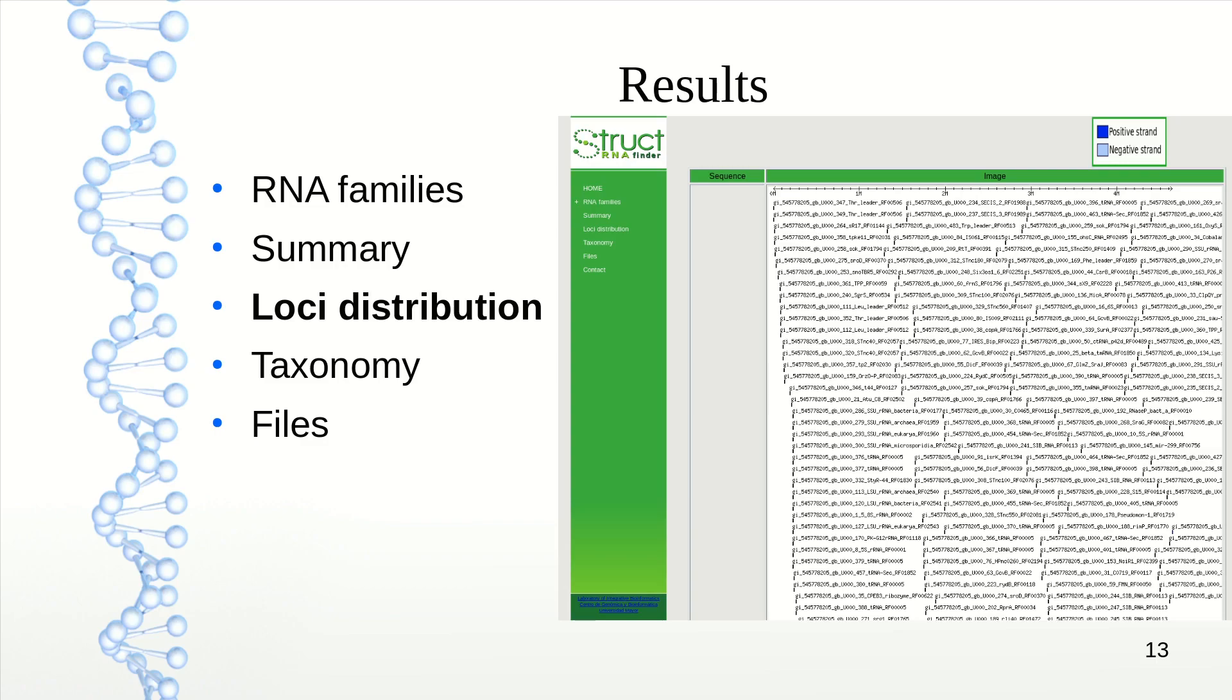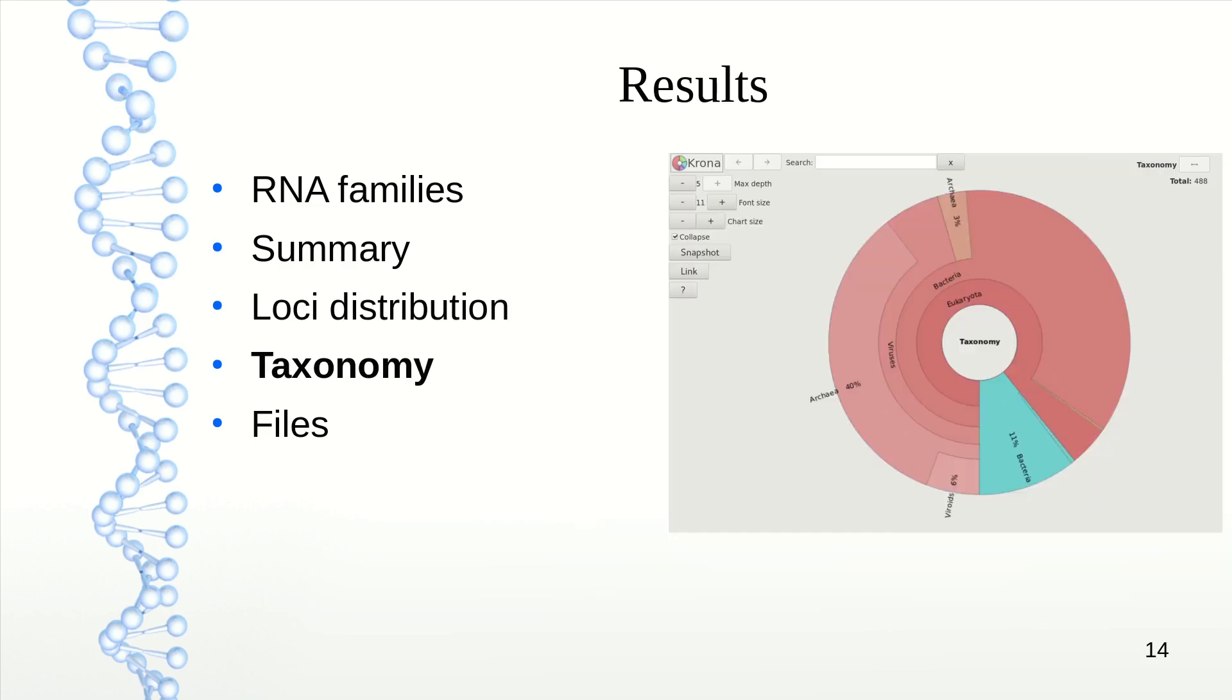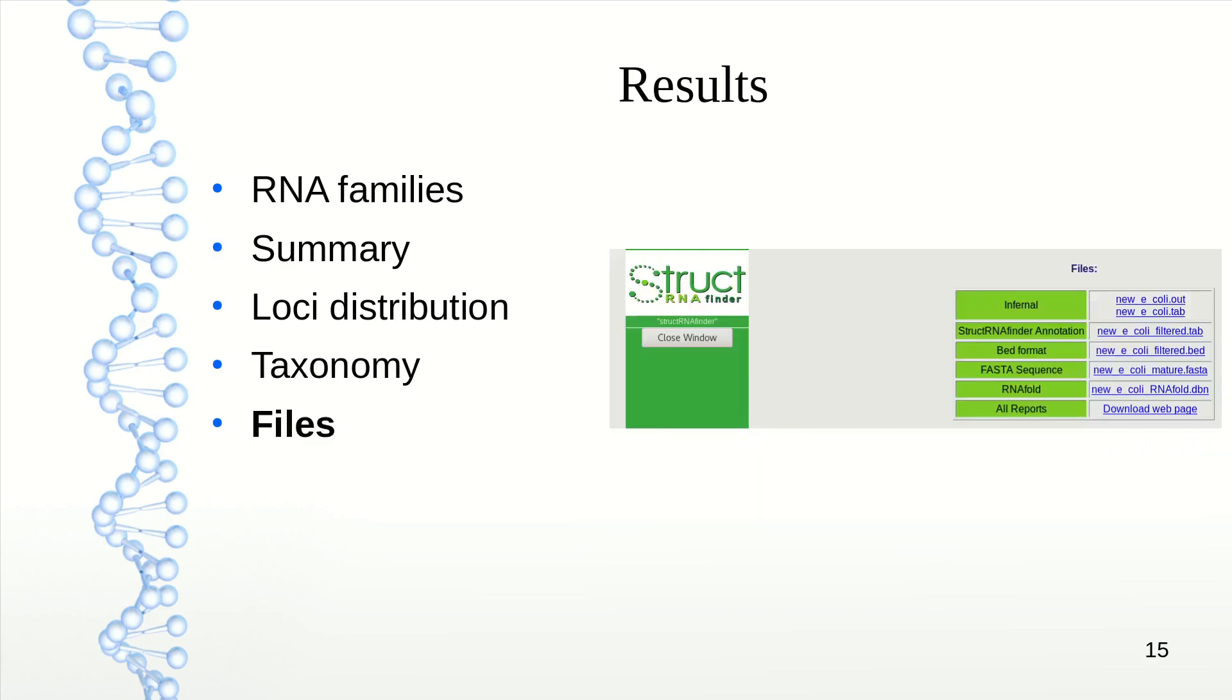Next, we have the loci distribution, an overview of where all results are found. You can see every RNA sequence has a position on the full sequence. Then taxonomy, showing specific organisms where each RNA was found - 40% from archaea, 11% from bacteria. Last, we have the files section with all intermediate files used to generate the HTML. Instead of assembling 6 files together, it does that for us.